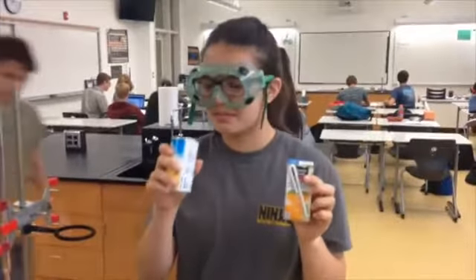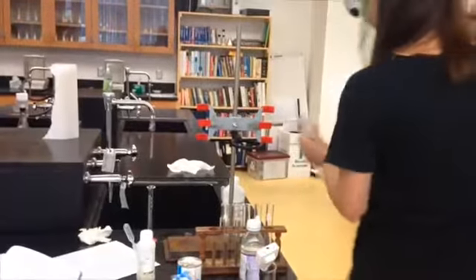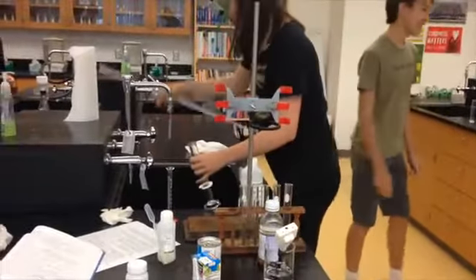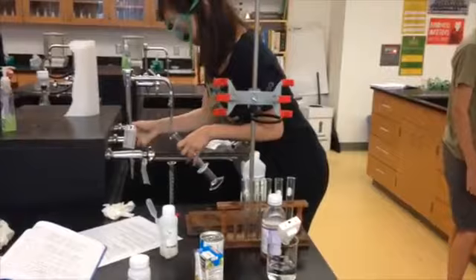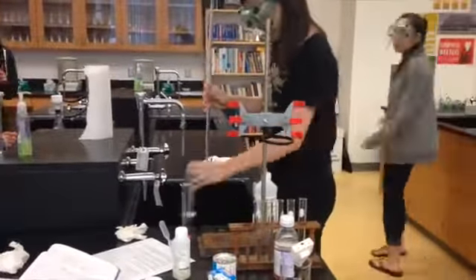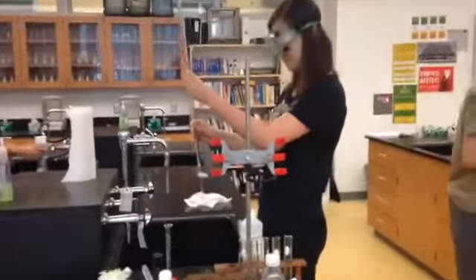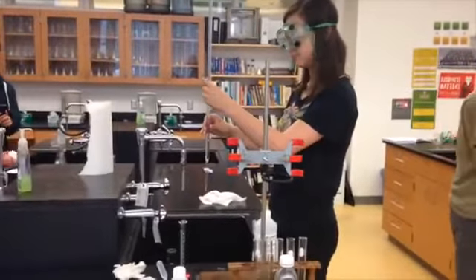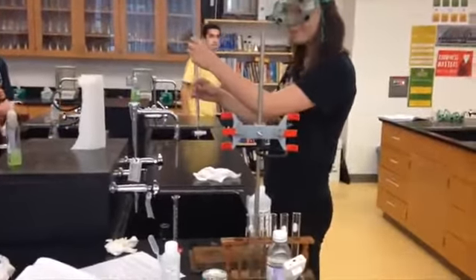Once you're done with your first titration, repeat the process with the other two juices. Once you're done with the titrations, it is important to clean up your lab station properly. Carefully and thoroughly rinse your burette and the rest of the glassware. Then make sure all of your materials are back in their proper spots.